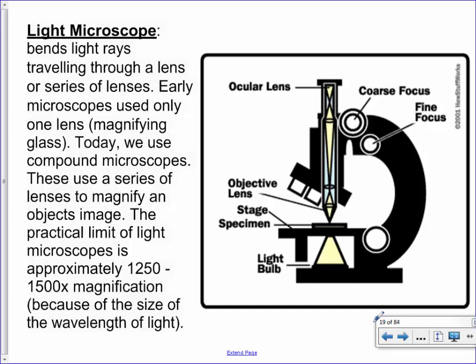Here's a basic light microscope. Okay. This particular one is going to have a plug-in, so you'll need to plug this one in for it to work. One of the key components, does it come out? It does too. Okay, maybe it doesn't come out. Is this piece right here?